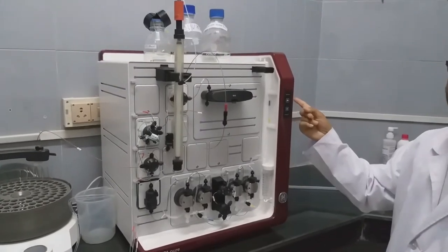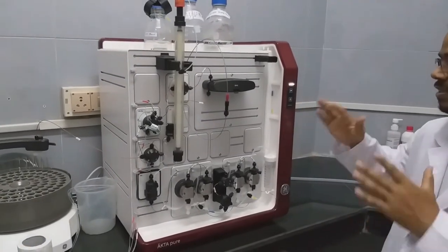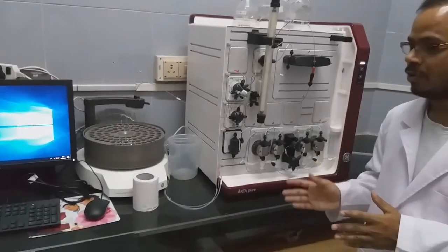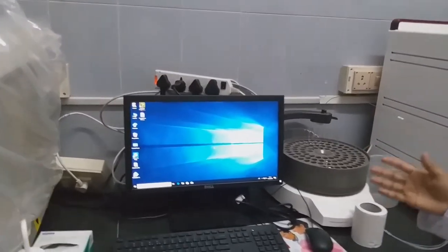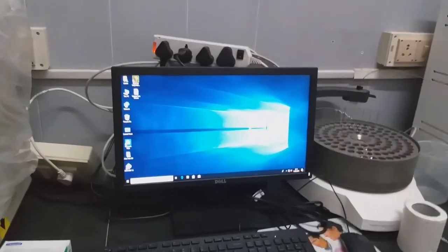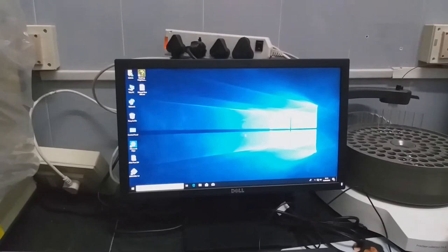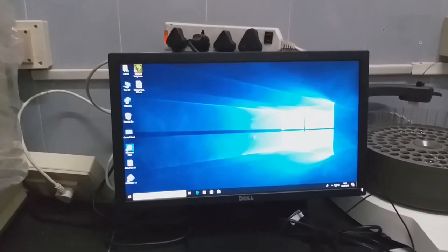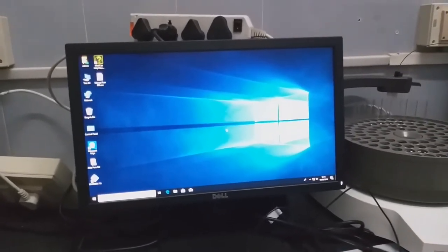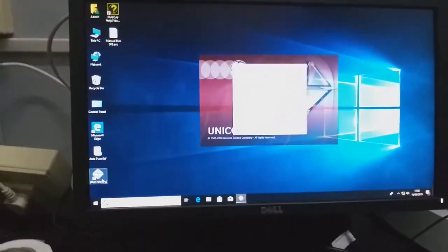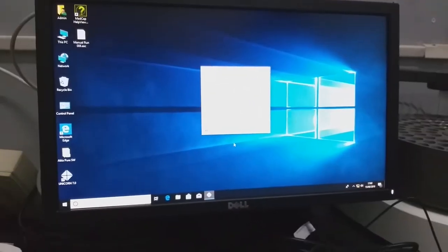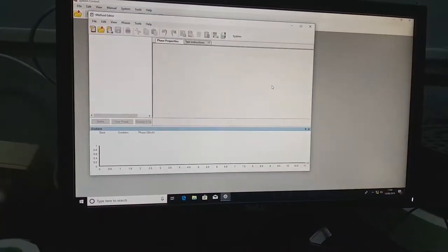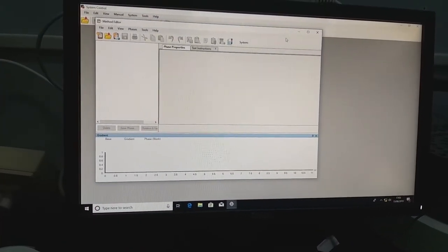After turning on the instrument, we go to the software part. For analysis of any elution, we use the software that comes with the instrument — it is the Unicorn software, used for analysis purposes. Just double click on it and it will take you to the software.